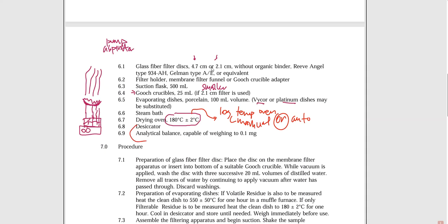So the purpose of the desiccator is to keep things dry. What happens here is that if I'm evaporating this water off and I've got this residue crust that is left behind, then the desiccator is going to be used to place that evaporating dish on the inside, and it will help keep that evaporating dish dry. The desiccator's purpose is not to dry. That is not why we do that. It already has to basically be dry before we put it in the desiccator.